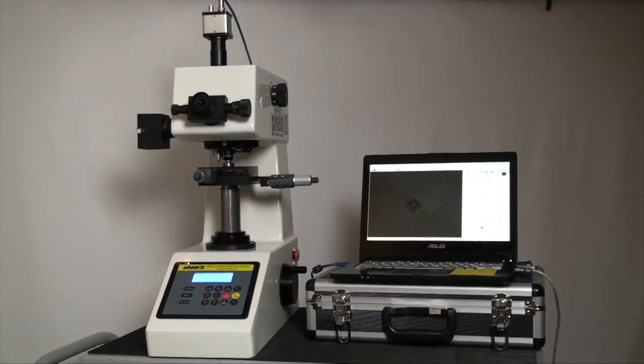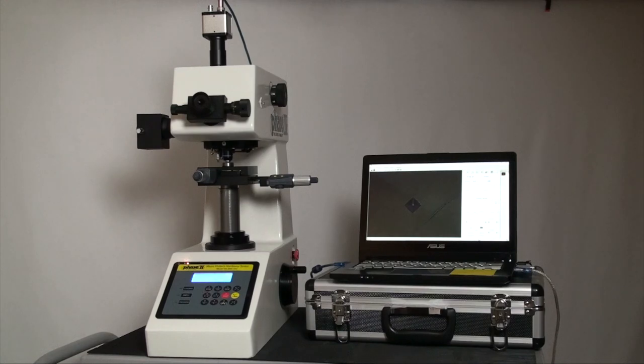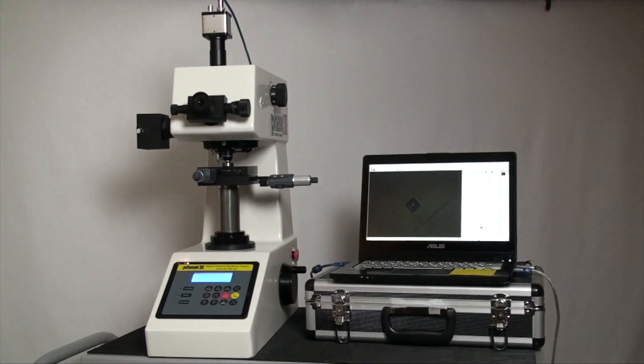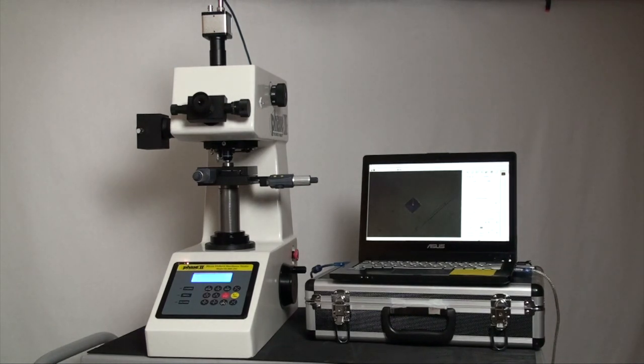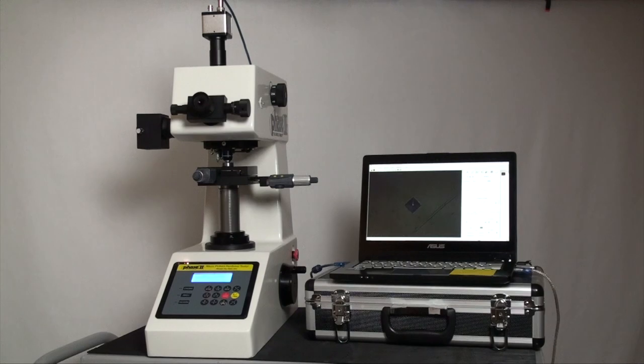Note that should anyone prefer to use this system without the digital optic system, they are free and able to do so. Manual optics with drums are in place and keypad can control all aspects of the tests. However, today it is quite rare to bypass the easy use of a computer screen to see the indentations clearly and work with data in a digital format.